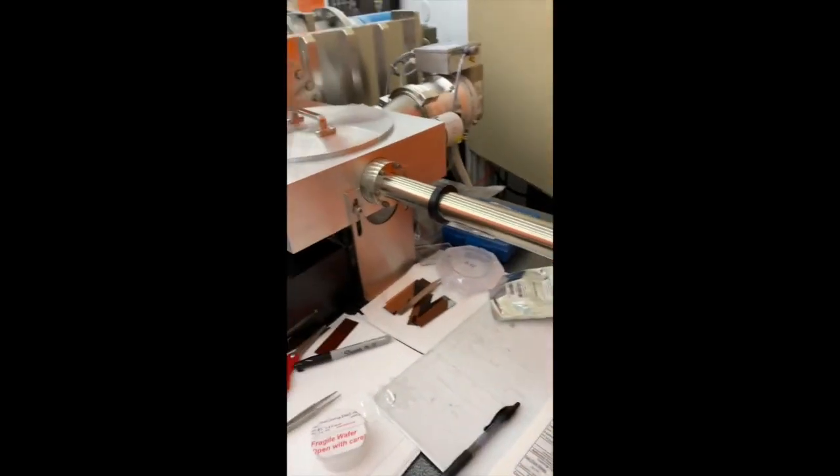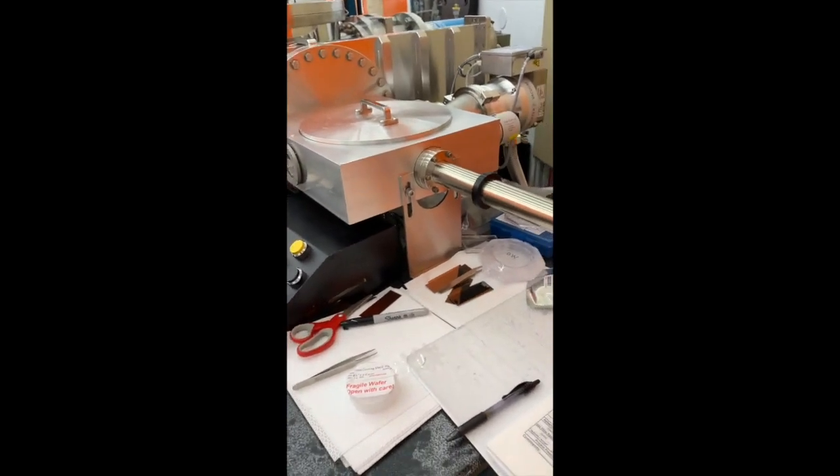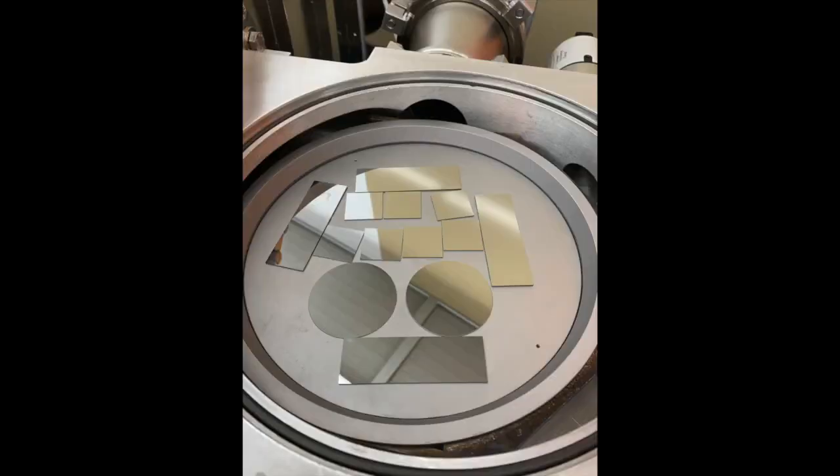Once the process begins, we can now observe the plasma, which is the argon ion striking our target and depositing our film. Once the process is over, we can then open the gate valve and transfer the sample platen back into the load lock. At this point, we can close the gate valve and vent and remove our samples. And this leaves us with a nice uniform metal coating on our substrate.